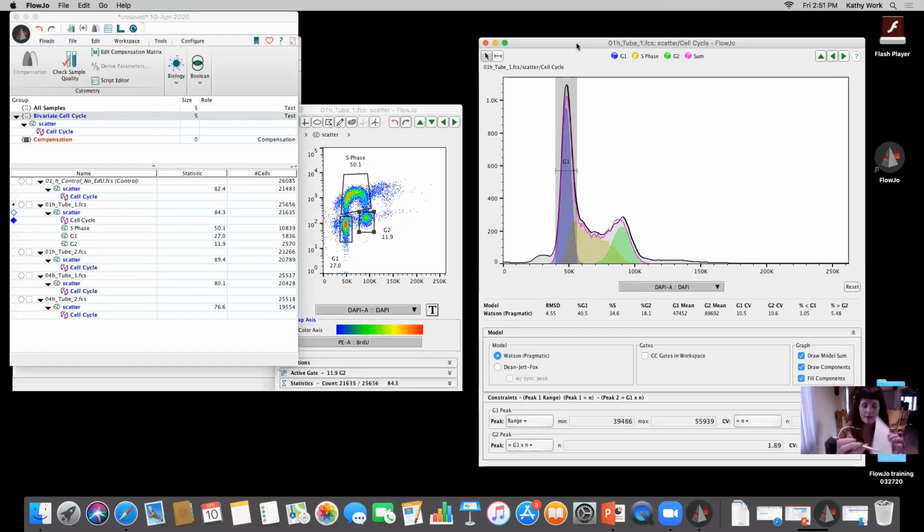So if I had a histogram, and we looked at count on the Y axis, because it's a histogram, and intensity on the x-axis, and say the count was just 1 or 2, this parent population would be the higher intensity.